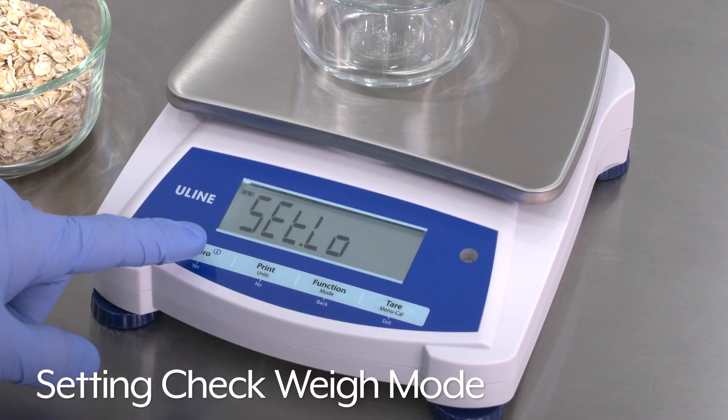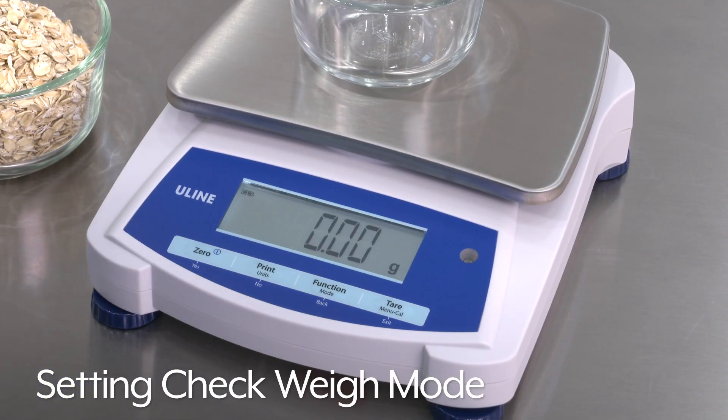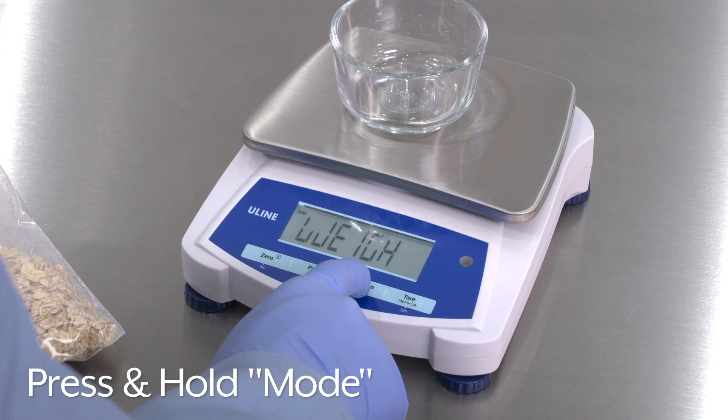To begin, press 0 to reset the scale. Press and hold Mode until Check is displayed.